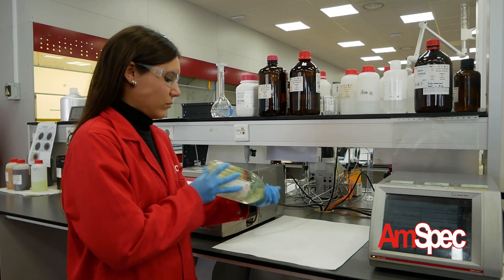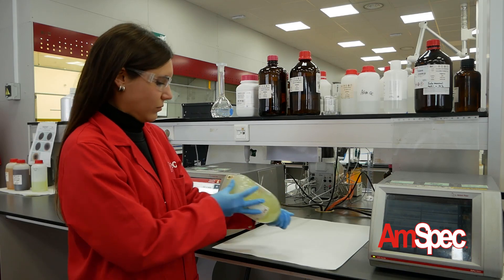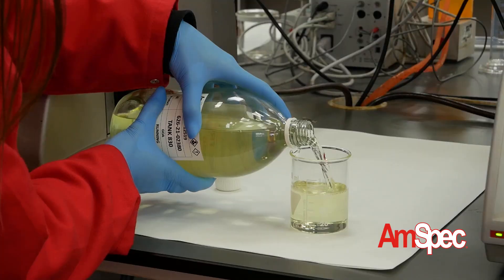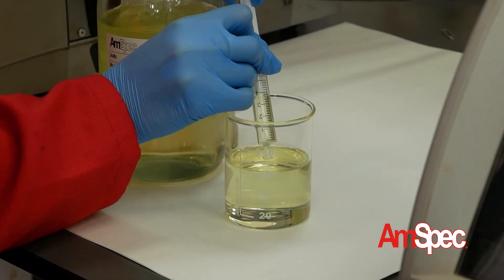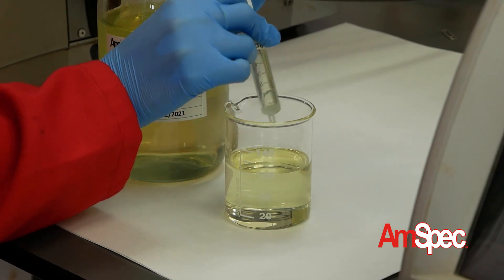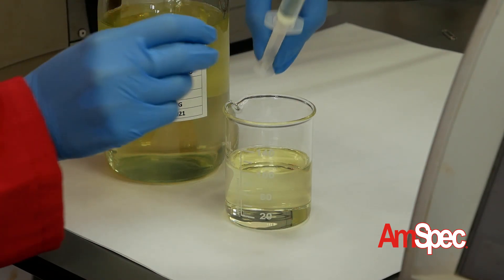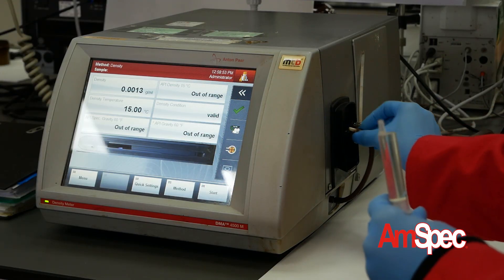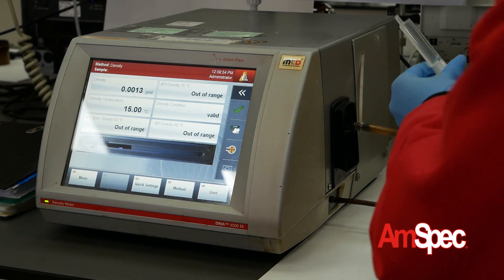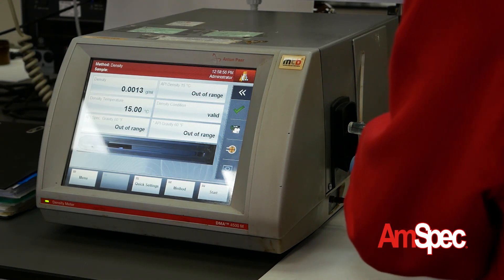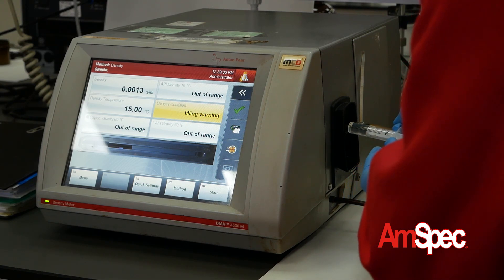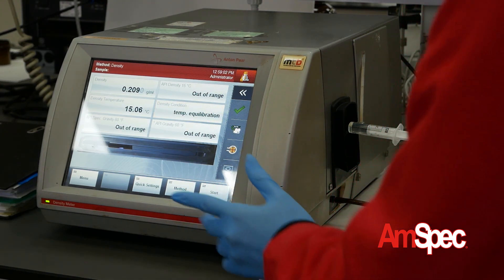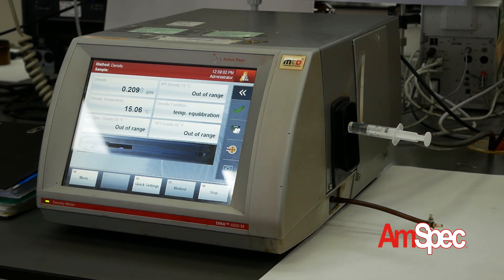The bottle is shaken for the homogenisation of the sample. A portion of 5 millilitres is taken with a syringe and 1.5 millilitres of sample is injected in the equipment. The U-tube is checked to ensure that the portion inside the tube does not contain bubbles. The analysis begins by pressing the start button.